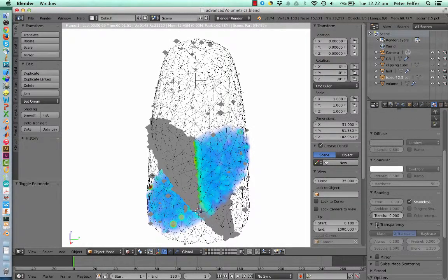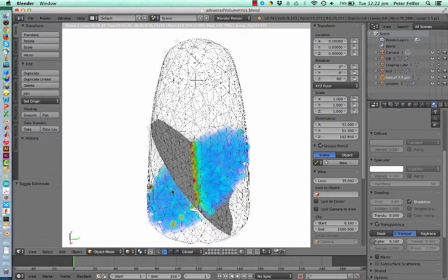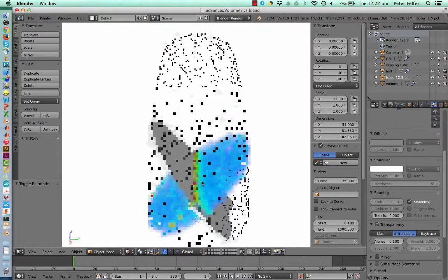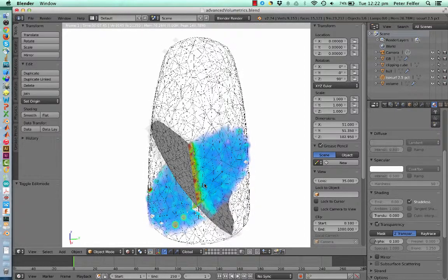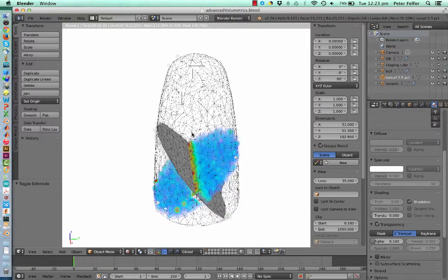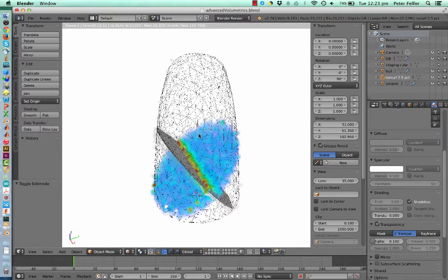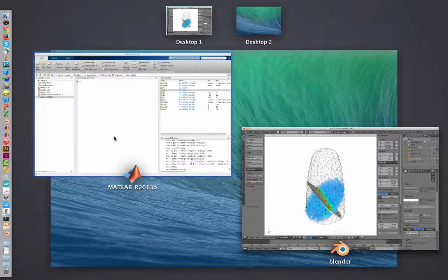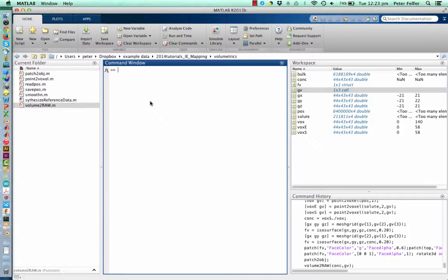So you can see you've got an isosurface here. I've just rendered it with a lot of transparency, with the grain boundary model and the volume data associated with it. And I just want to show you how to do that, give you the programs, and you guys can do it by yourself then. It makes for very nice animations. I've linked some on my YouTube channel for you to watch, and also for very nice publication quality images.